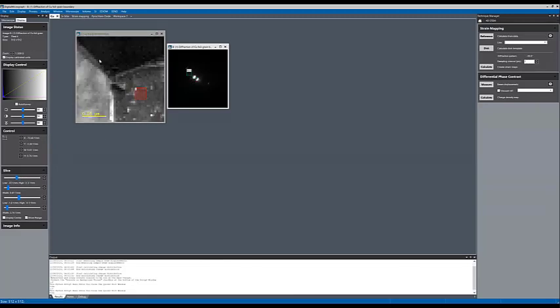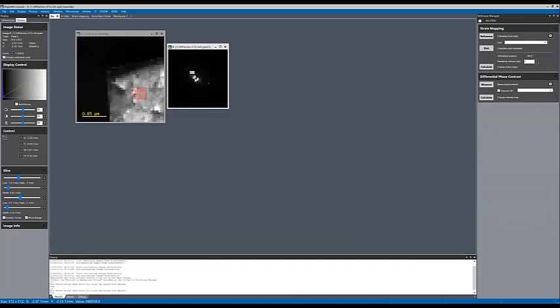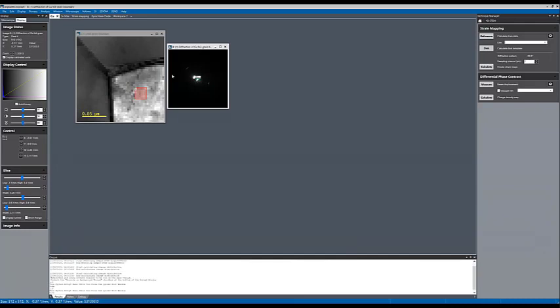Also the contrast in the front image and the diffraction pattern changes. If I change the size of this green box, you can see the sliders move and the contrast changes. Somebody was asking earlier, what is the contrast that we see in the 4D STEM data front image?